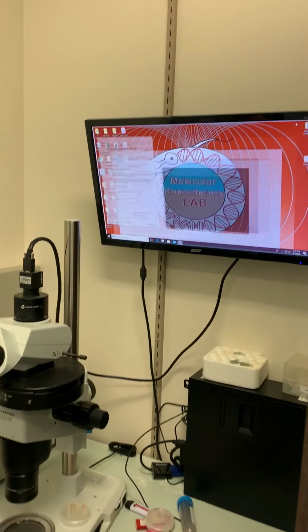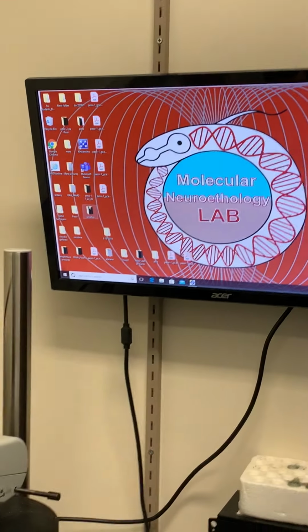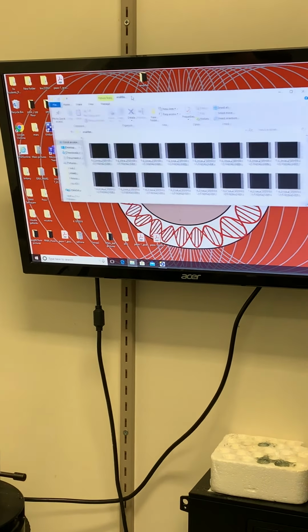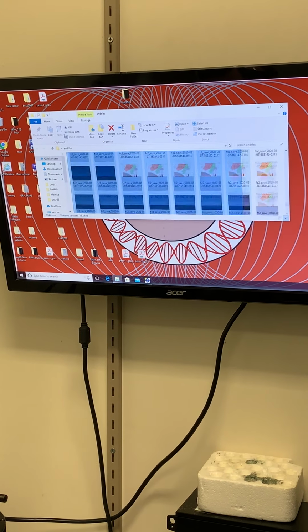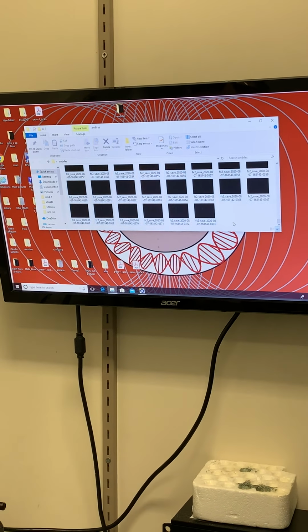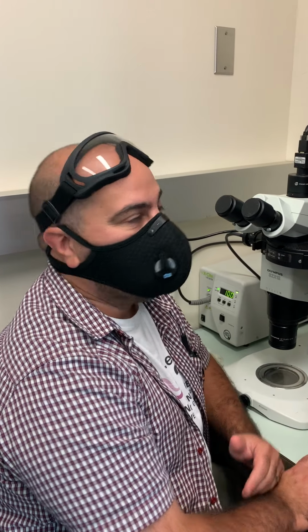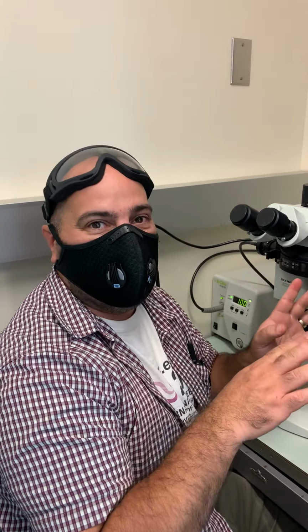So let's go. There should be a folder on the desktop called something like my name, which I butchered, but that's not a big deal. And all the files are here. So 15 seconds at 30 frames should be 450 frames, but we didn't get 450 frames. We got 373, so it dropped a lot of frames, okay? But still, you know that it took 15 seconds from beginning to end.